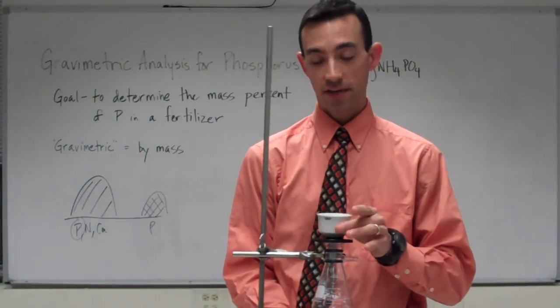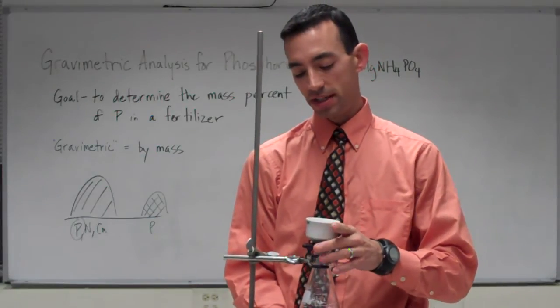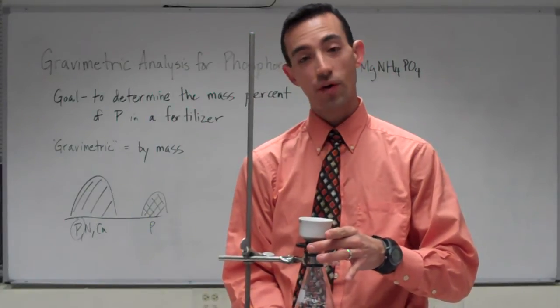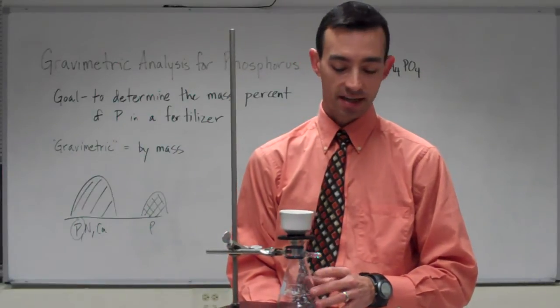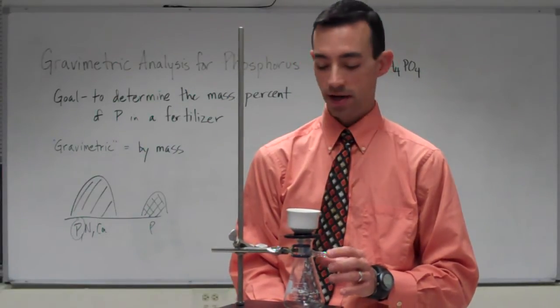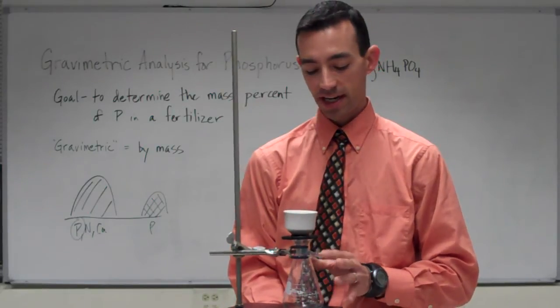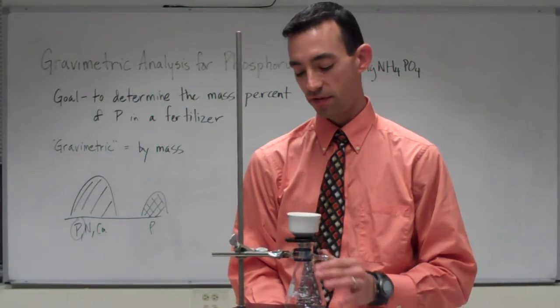The top part of this is a Buchner funnel, the white porcelain funnel. This is mounted atop what we call a filter vac, this black rubber ring to create a seal, to an Erlenmeyer flask that has a side arm on it. This goes in one of the fume hoods, to which it can be connected, of course, to the vacuum apparatuses at the back of your fume hoods.